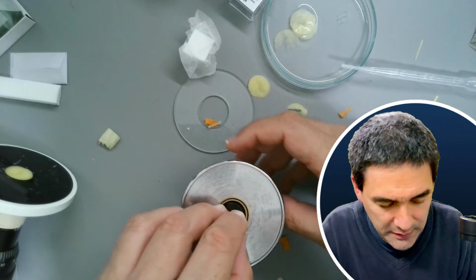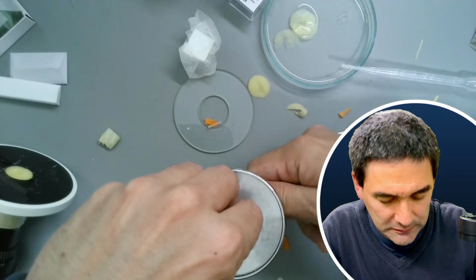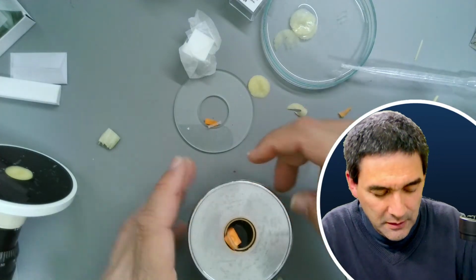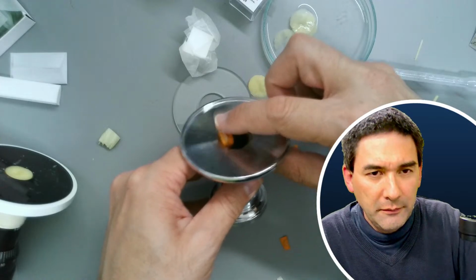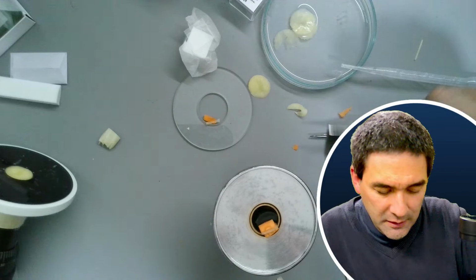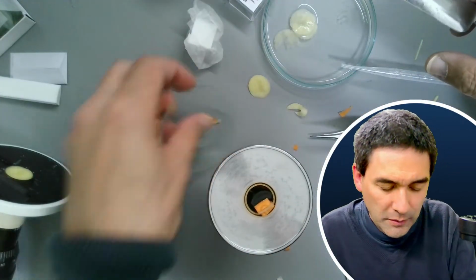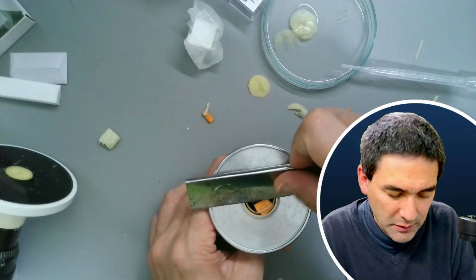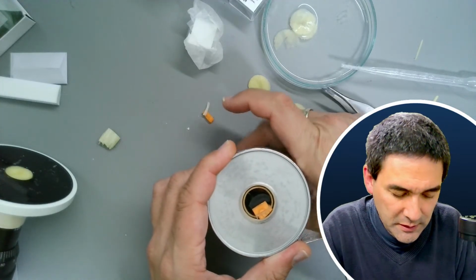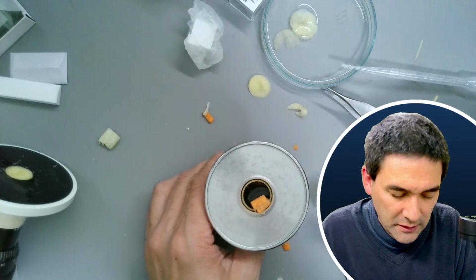So here again, let's clamp it down. I hope that this is now stable enough. If it's not deep enough, then it can be pushed out again. So let's try it. Bad. That's why it didn't work. So let's turn it out and let's try another one. Still too deep down.